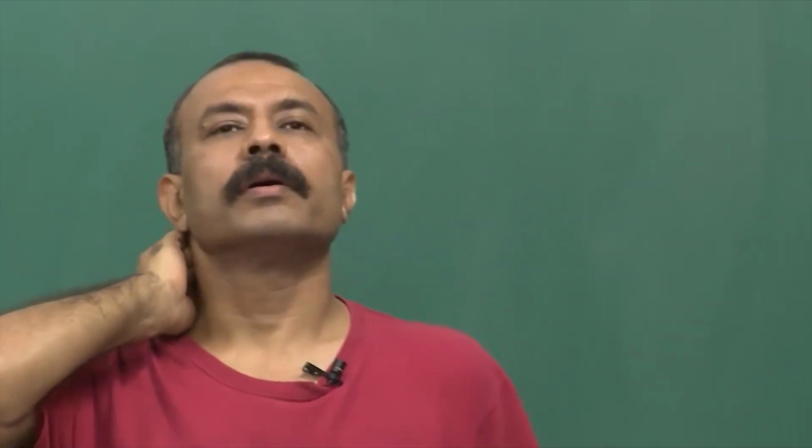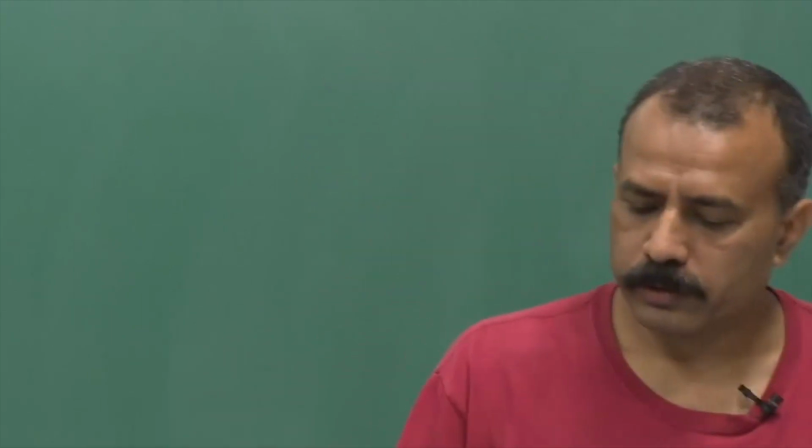Definitely whether the cells contract or not, and mind it, cardiac cells are spontaneously contracting muscle. So, there are three muscle types. That is the reason why I want to touch this. So, let me just pull it down. So, this is our lecture 5, week 7, W7 L5.